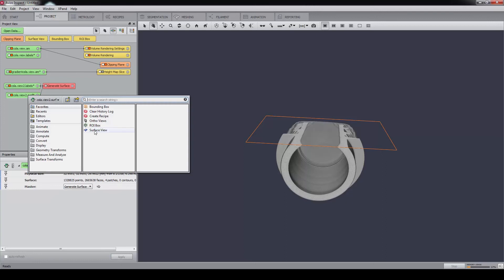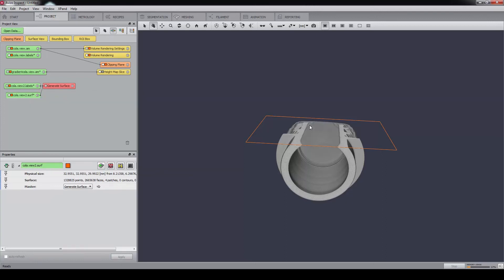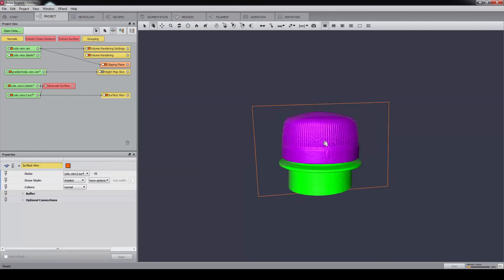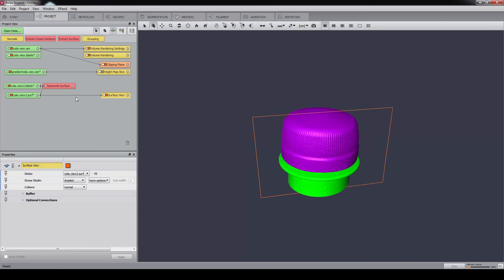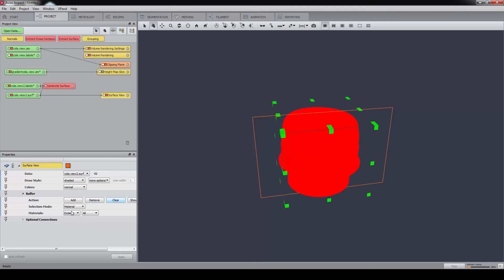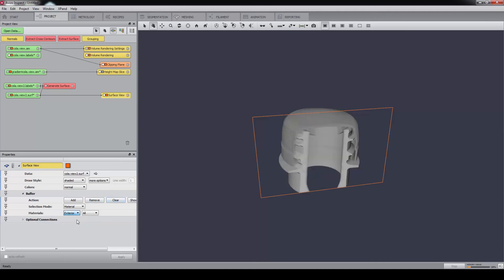We can then visualize the contact area by using the buffer. First, remove everything and select only the triangles that are common to cap and bottle materials, which is in fact the contact area.